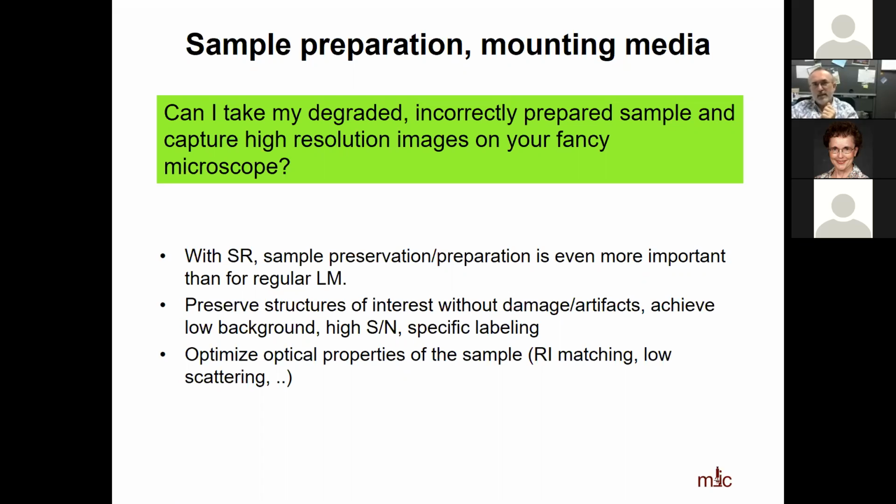Yes. So I would say either that, or you could start contemplating the DNA paint or the FRET paint method, if it would be applicable. That might be possible, taking advantage of the light sheet system. But we have never tried that. Right, so that would be really interesting. But it's not like I can just hand you a protocol and you follow it and everything is going to be great. That's how it normally works out, Doc. Oh, unfortunately. Well, not this time.